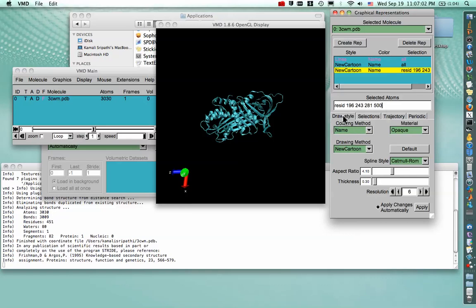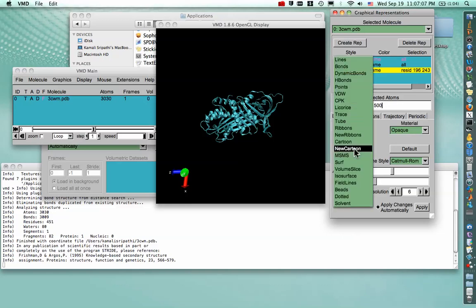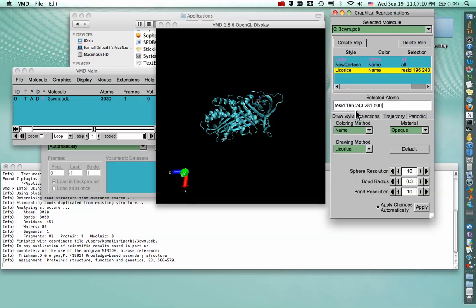And to change the drawing method of our selection of residues, go again to Drawing Method and Licorice, which is the VMD version of STIX. You can see that they already have shown up here.